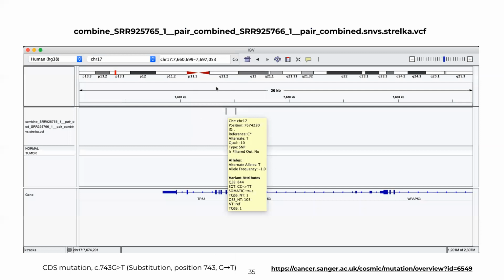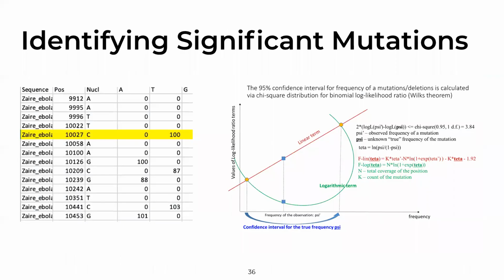And we saw how we can find the same information but condensed that is going to reveal a change, whether it's somatic or germline, and how do we start interpreting that based on annotated known SNPs that have been found in other data sets. Eventually, we'll also get to learn about comparison of multiple samples. For example, if we have multiple samples from healthy individuals, multiple samples from cancer individuals, or we have different types, for example, some that are more aggressive or less aggressive.